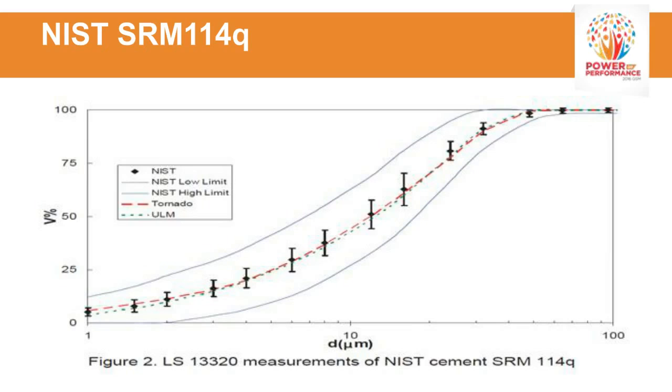And so this shows quite good agreement between both wet and dry. Cement typically disperses pretty well both in a wet and dry state. So when there's no problem with dispersion or stickiness of materials, wet and dry should agree with each other similarly like this. And this shows the quality of data you can expect from the LS for running cements.